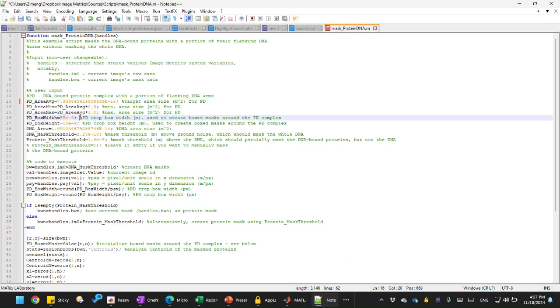So you can get a maximum and a minimum, and then you can take the average between the maximum and the minimum. Then take half of that and make that the average. That's a better way to do that. So now we have the three parameters here defined.